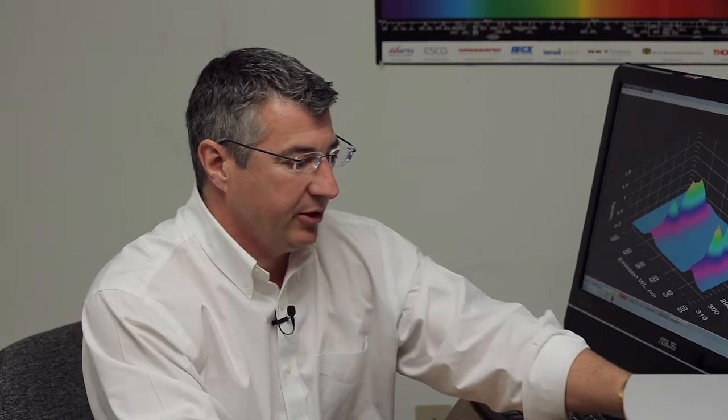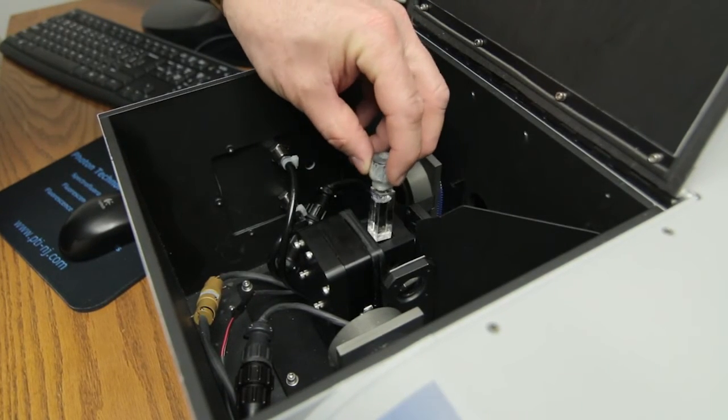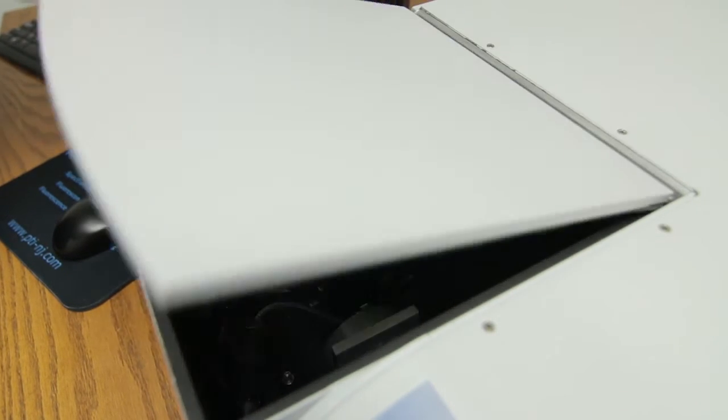So now we're going to actually run a couple of experiments, run a couple of spectra with a sample that we have here. This is a terbium. It's a very common rare earth. It's in solution in a cuvette and we're just going to put it in our cuvette holder inside the sample compartment and we're just going to set up and do an experiment.